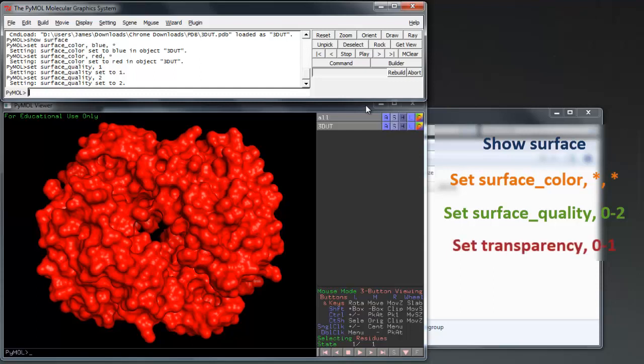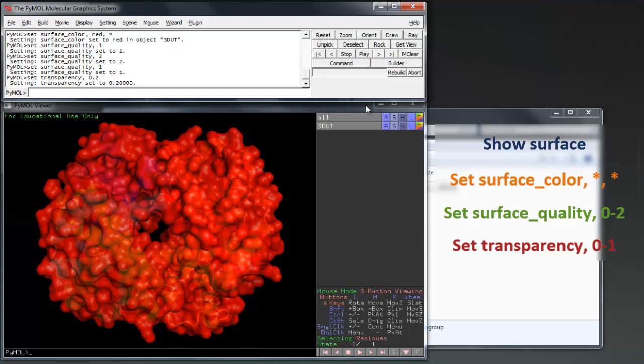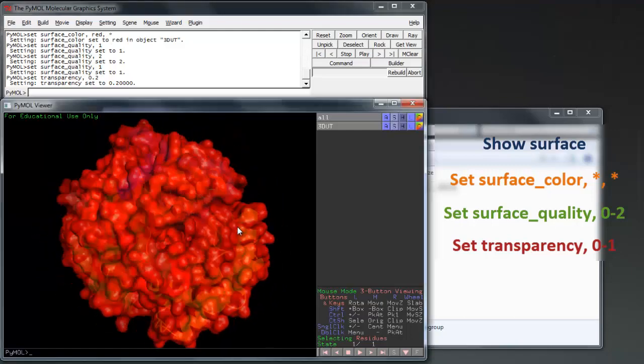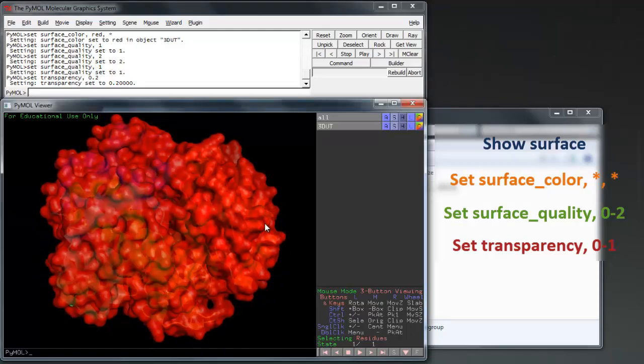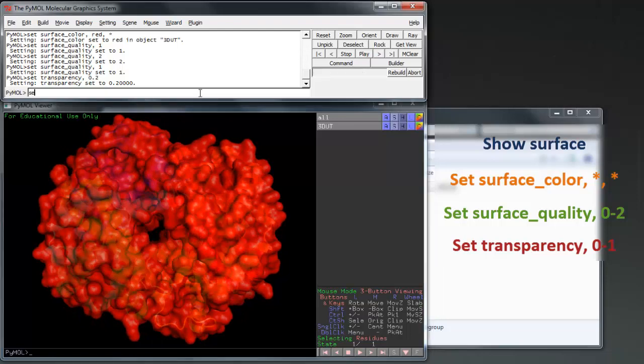To allow us to see the protein beneath this structure, we need to make it transparent with the command set transparency 0 to 1. Try a variety of fractional parts till you find one that you like. Around 0.7 will allow us to see clearly through to the inner structures.